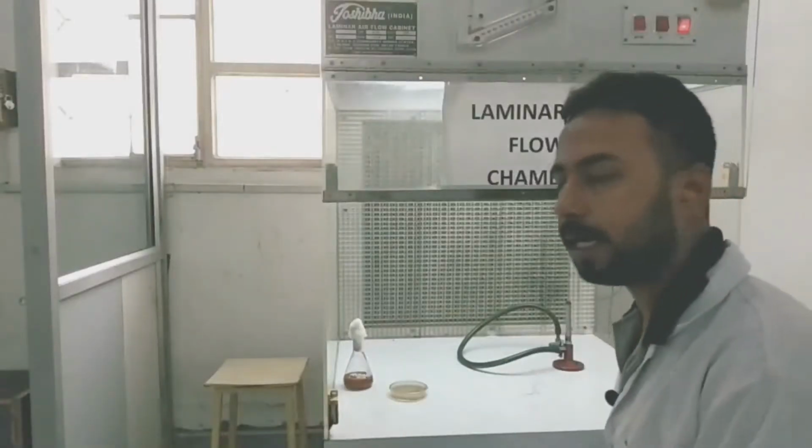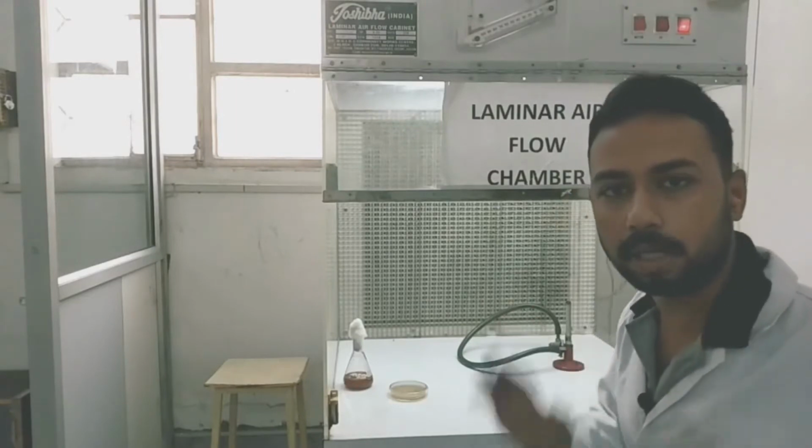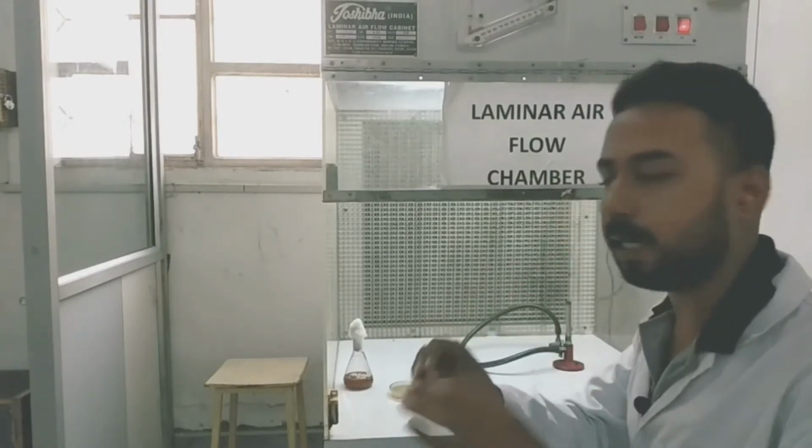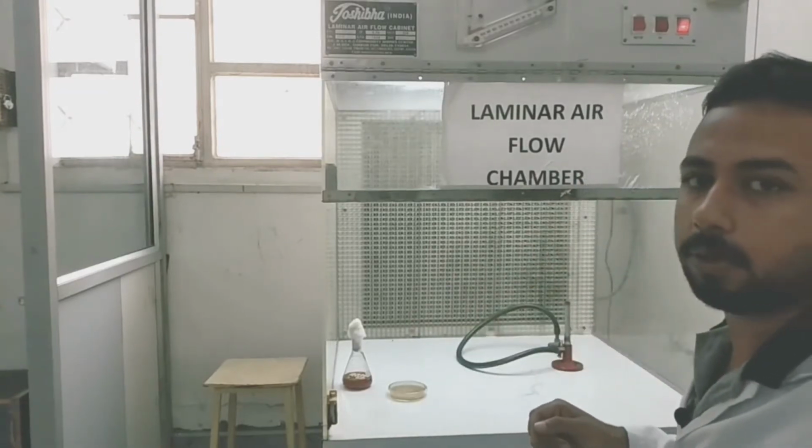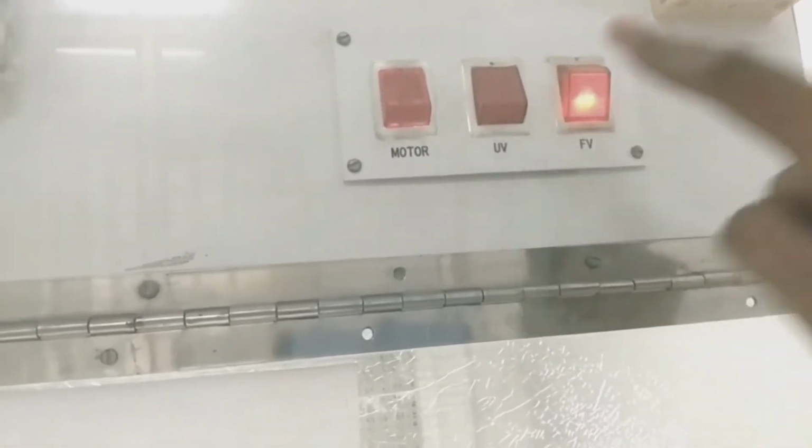Okay, so for working in laminar airflow, firstly we just have to sit on a chair. The main purpose is that we just have to do our work inside it. One more thing about this laminar airflow: it contains HEPA filters. As you can see, there are 3 switches. The first one is the motor, the second one is UV, and the third one is FV. So there are 3 switches. Motor is what starts the blower, so that the bacteria present in the air will also be filtered by these HEPA filters, so the fresh air will come inside it.